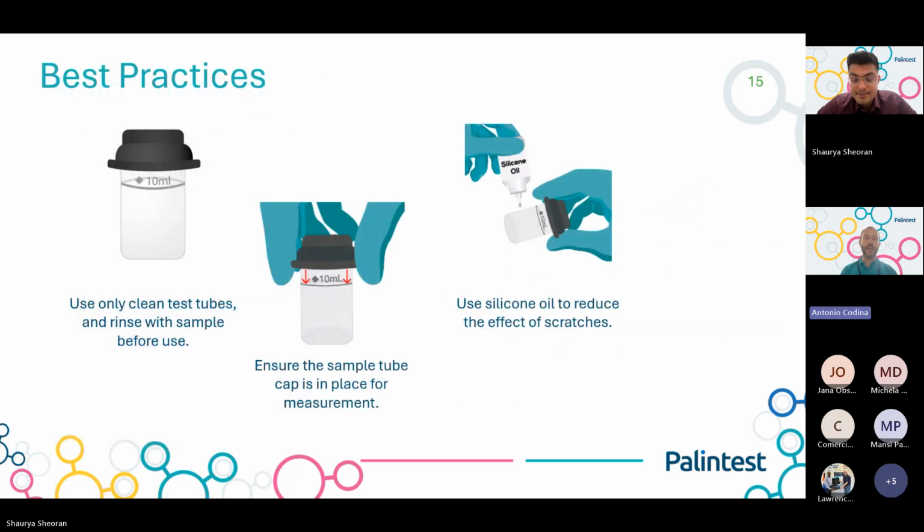Now, best practices. Measuring turbidity is totally different from all our other products. In other photometry products, we always have a reagent, and here there is no reagent. What you are measuring is your sample neat.